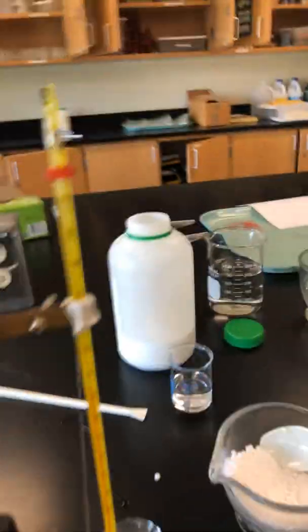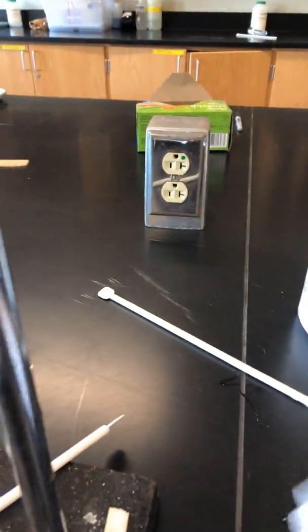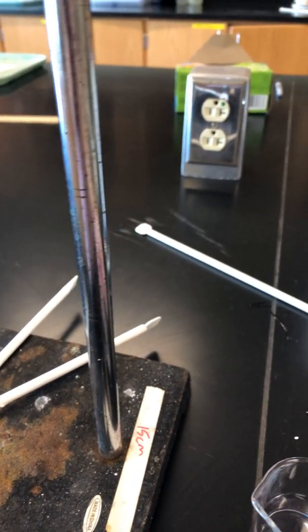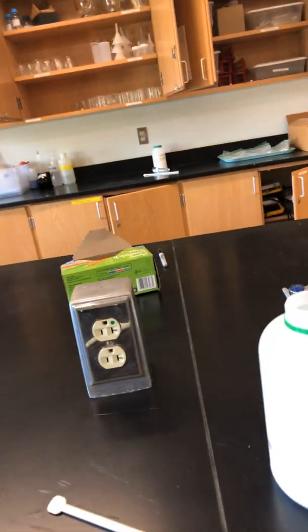Okay, I'm going to switch the setup. So I'm going to quickly clean off the thermometer. Okay, so now I'm going to put the thermometer back into a fresh beaker of water.